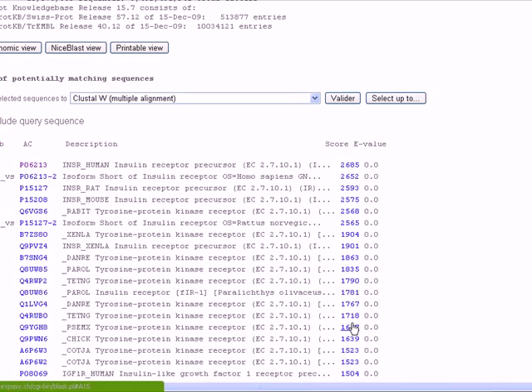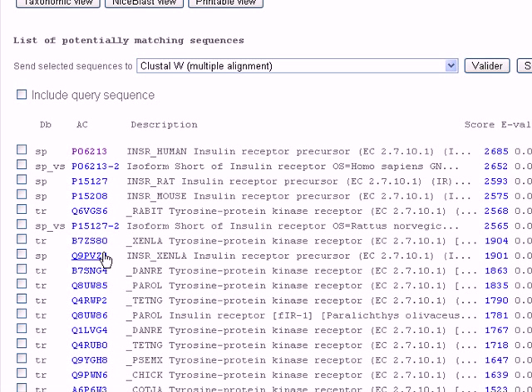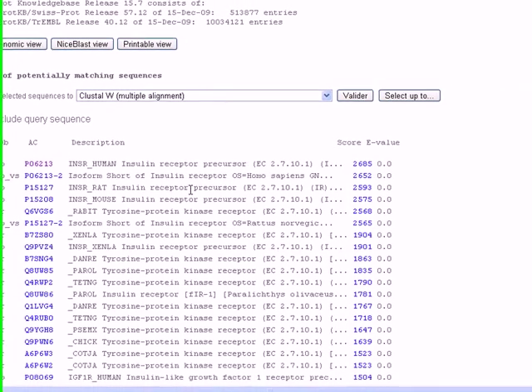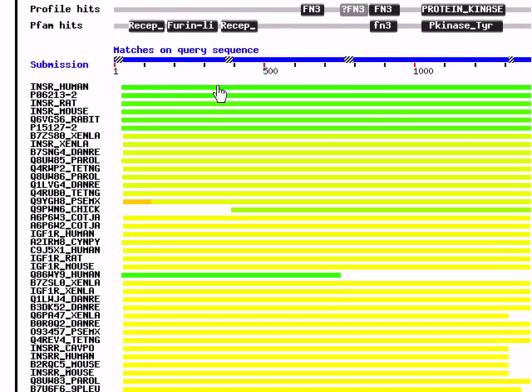This is the result page of the BLAST search. We can see here proteins, sequences that are similar to our protein. We can see the first ones, and most of them are an insulin receptor. That will give us precious information that our sequence may be an insulin receptor. We scroll down. We can see here the degree of similarity.